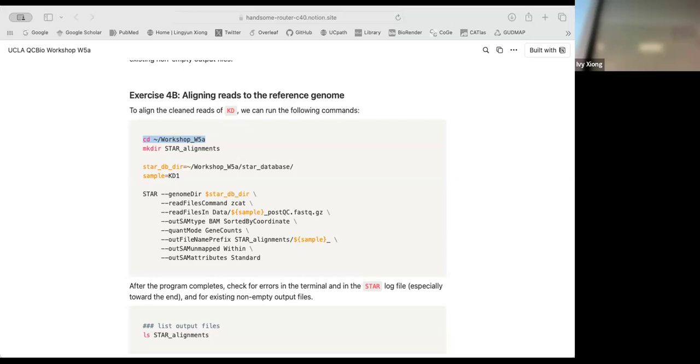I don't know why. Oh, no, unexpected end of file. Sometimes the file format can be corrupted, and that can cause this issue. So I need to change that. You can copy from the scratch. I have the design in scratch. Okay, so, view list.